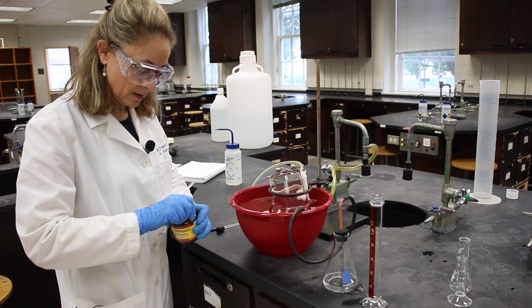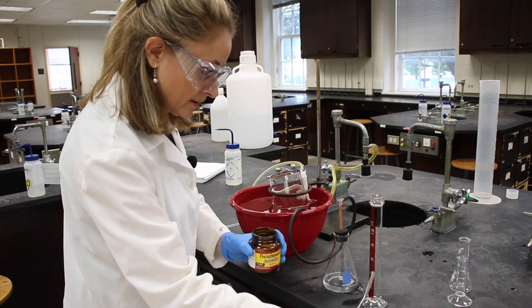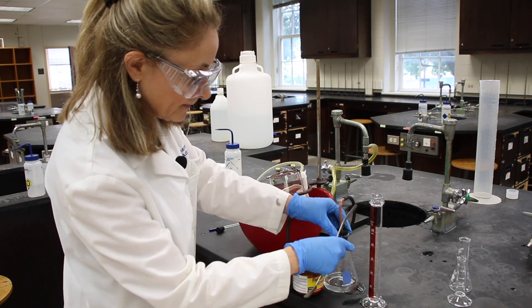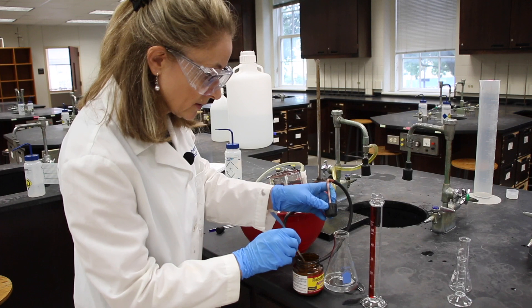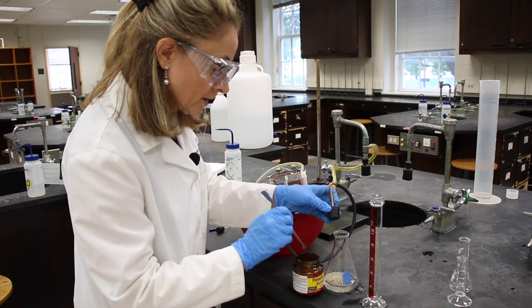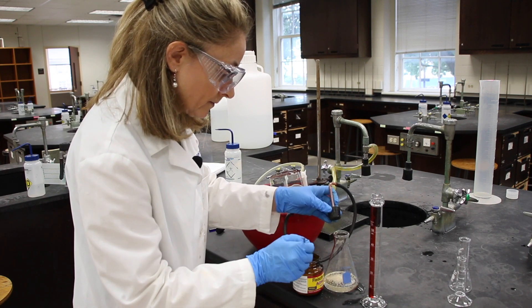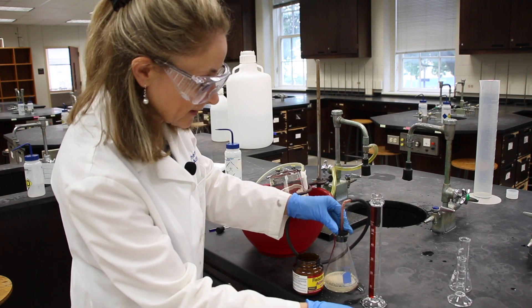And then add three scoops of yeast. This is going to be our excess reagent, so it doesn't really matter how much we add — one, two, three. And we'll leave that stoppered.